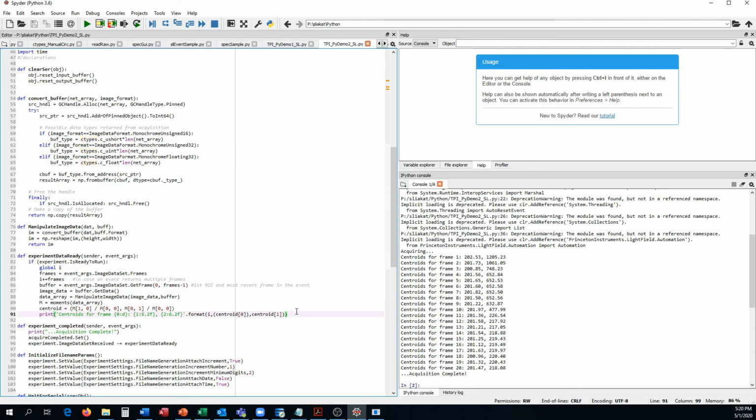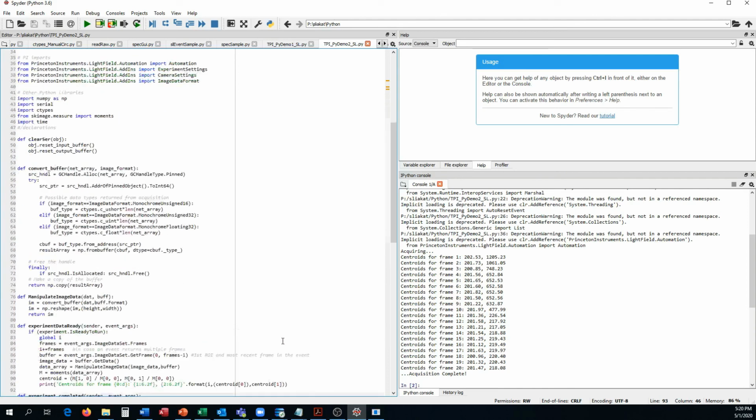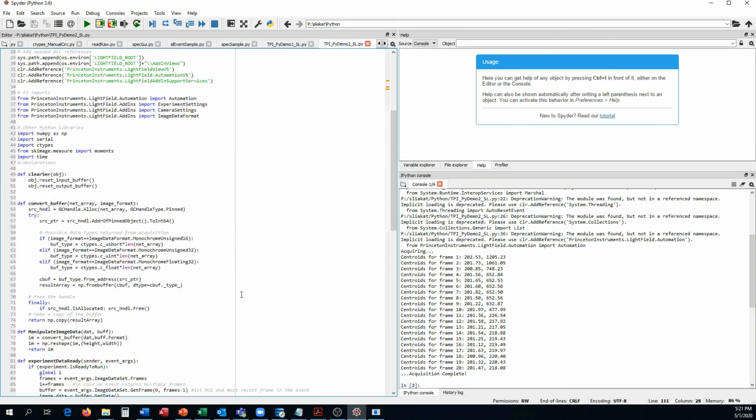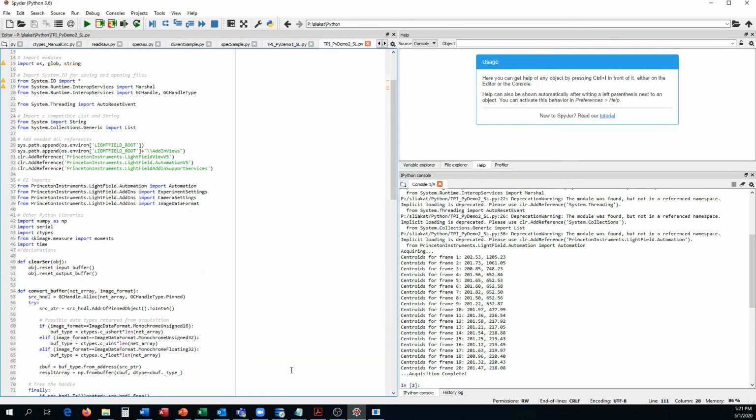I didn't even have to manipulate indices to read it as 1D for speed, and everything just works out great. So yeah, I love using Python. This last bit of the seminar is where I go through my opinions on using these development environments. That's my opinion, but again, there's a reason why I'm doing these seminars in Python, and cool things like this. Python just makes it so easy.